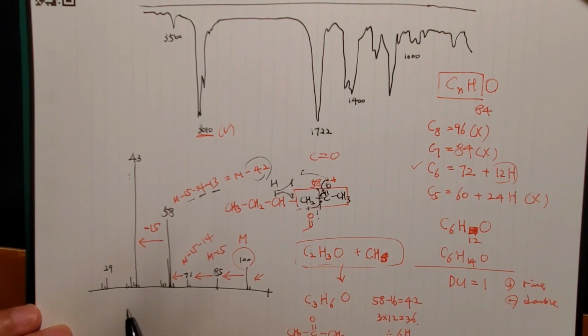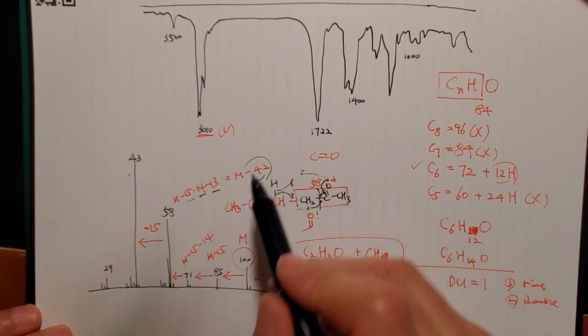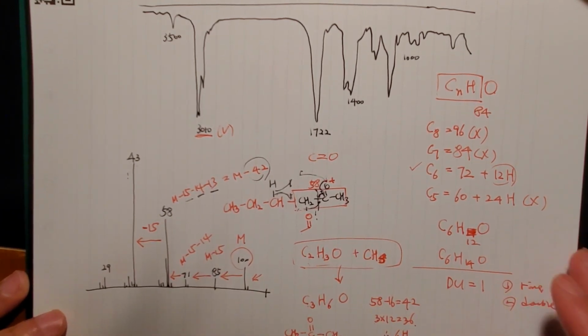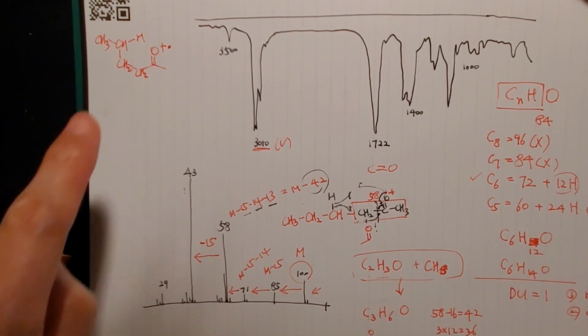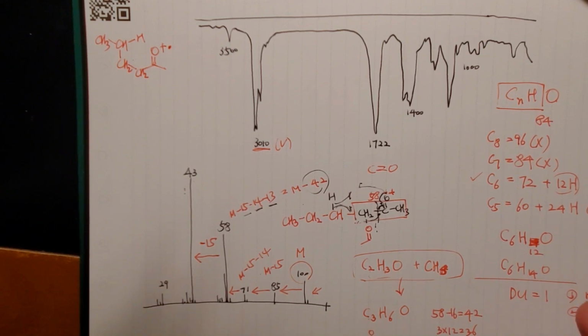So, forget about losing this hydrogen, right? Let's do it over here. See, you can lose 42 at once out of this. So what is the remaining mechanism for the carbonyl group? I drew the molecule this way to show the fragmentation mechanism.